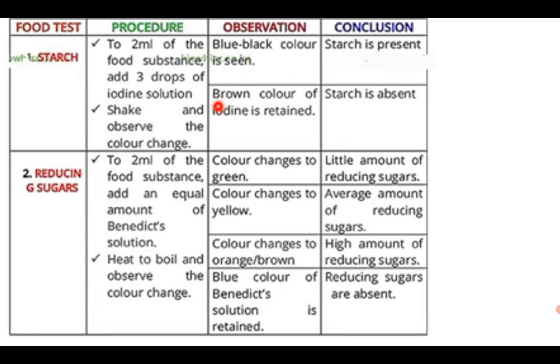However, if the color remains brown, in other words, if there's no color change, it means that starch is absent. So if the food does not contain starch, the brown color of iodine will not change.